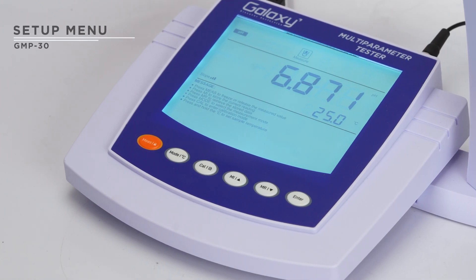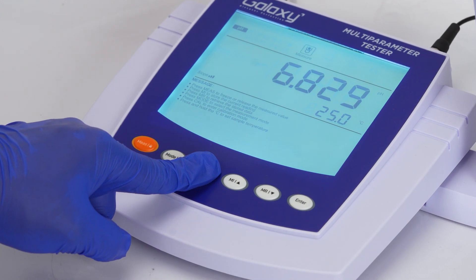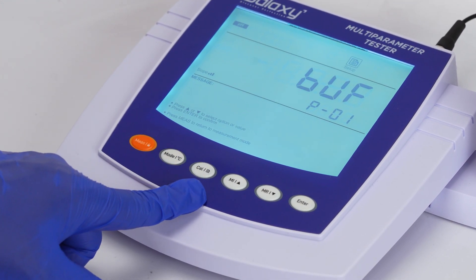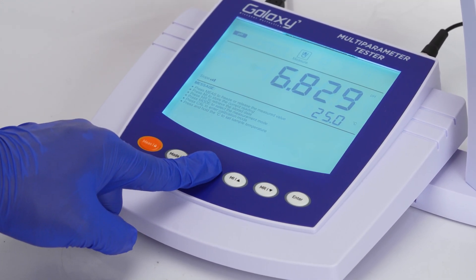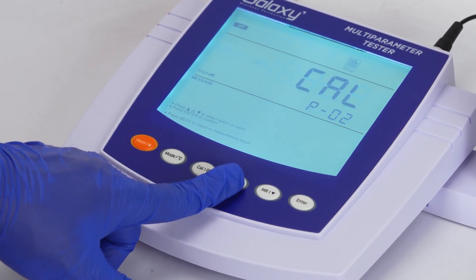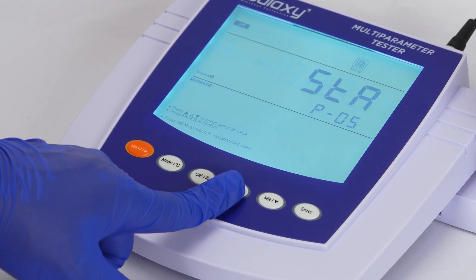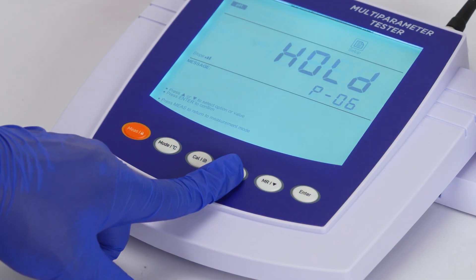To access the calibration menu, long press the cal key. In this menu you can adjust settings like buffer group, calibration point, resolution, unit, stability criteria, and auto hold.